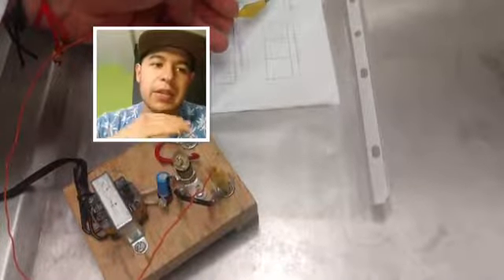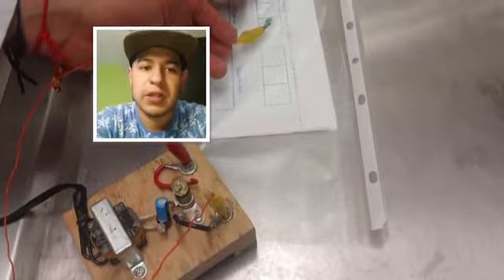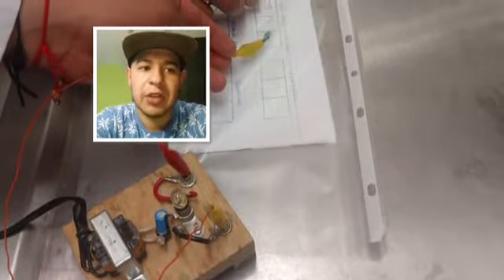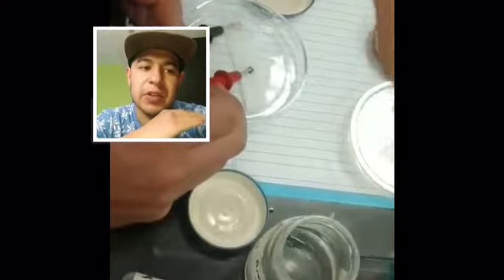This practice was divided into three experiments. The first one was to make drops of two different components, one with a positive charge and the other with a negative charge, in order to perform a reduction oxidation type reaction.